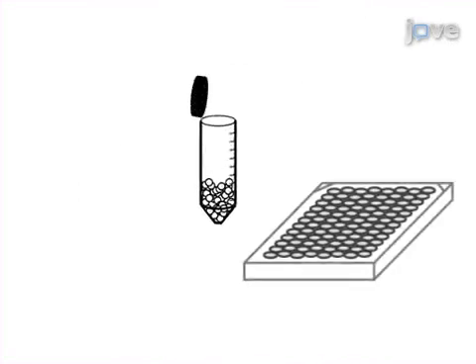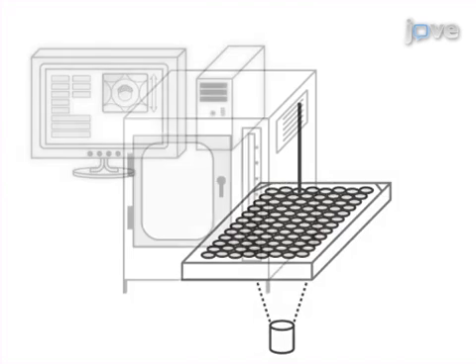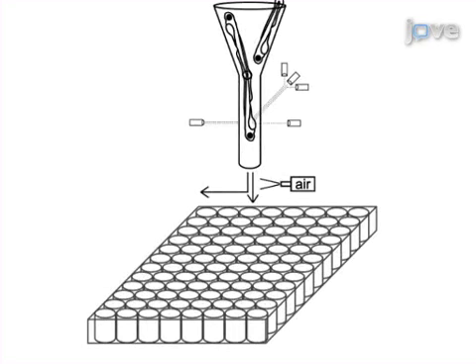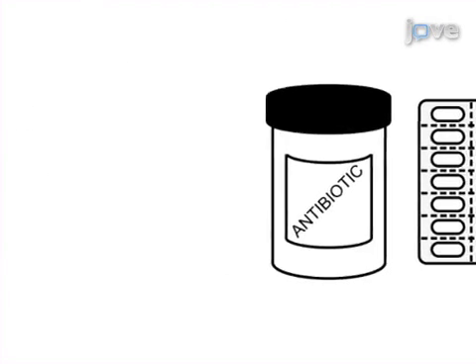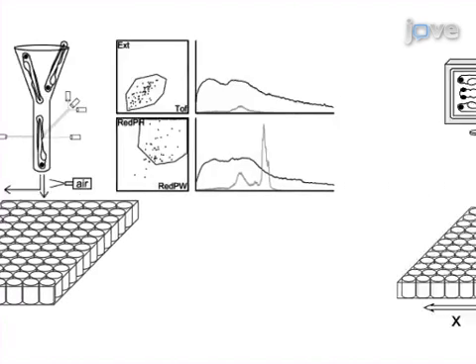Next, the eggs are aligned into an agarose grid and infected with bacteria in the yolk using an automated microinjector. When the infection has spread through the embryos, they are pre-sorted by large particle flow cytometry before being treated with drugs. Finally, the bacterial burden levels in infected embryos are analyzed after compound treatment.